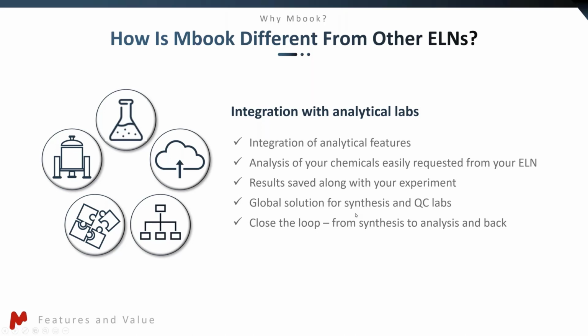And the last step, where we are moving on right now, is integration with analytical labs. So not only to have the full chemistry environment, but also to be able to request analysis, to have the analysis done by the analytical department in your institution, or actually it can be outside of your institution, and have the results pushed back automatically when the result is done, together with the original data set, which is very useful for a global solution when you are sending samples somewhere else and you would like to receive the data in a safe way.